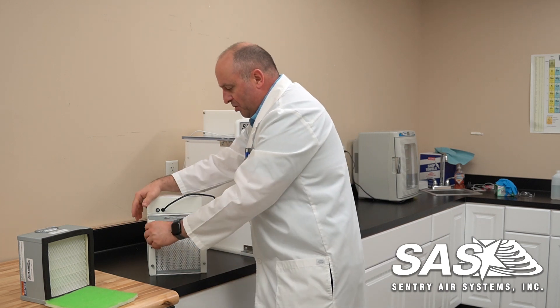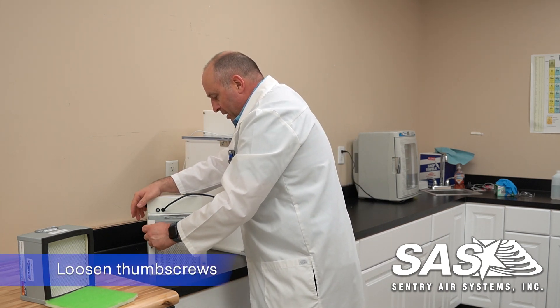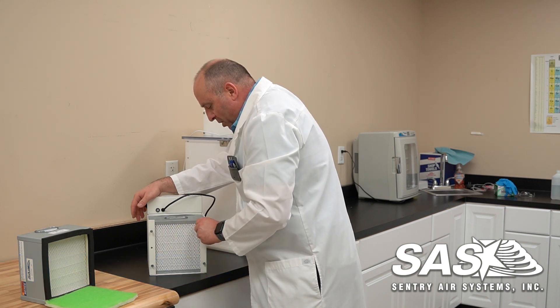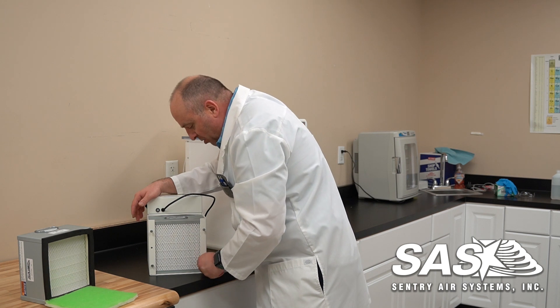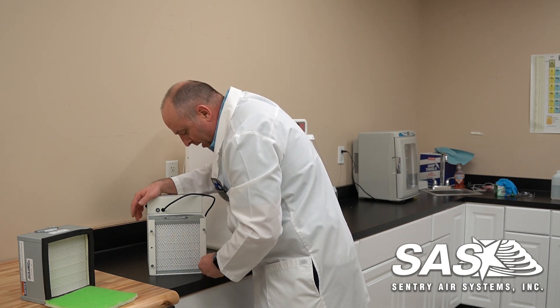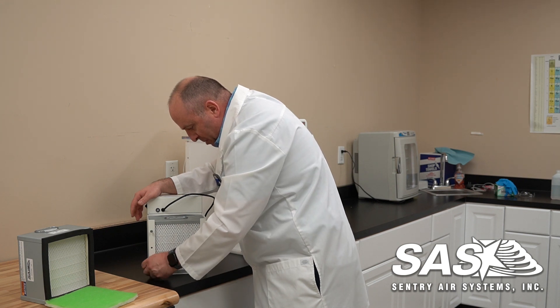From here you can see we have four thumbscrews and we want to loosen these up. I'm going to back these up so it's level with the frame so it doesn't catch the filter when you try to slide it in. And if you back them out too much, that's okay — it's threaded, you'll be able to put these back in.